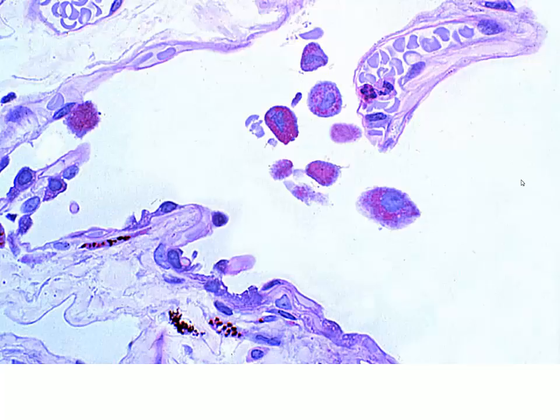Now, as we get closer and closer to actual respiration, here we're beginning to look in our alveolar tissue. Many of the cells that we're looking at that line these alveoli are going to be quite flattened. So these are going to be our type 1 pneumocytes. And yet we're going to have these very tall cells that are going to be our type 2, our giant alveolar cells that are present, again, on the surface of our alveolus. And then we're going to have our resident macrophages that exist in the alveoli, and these are going to be our dust cells.